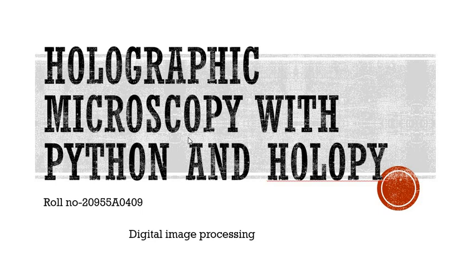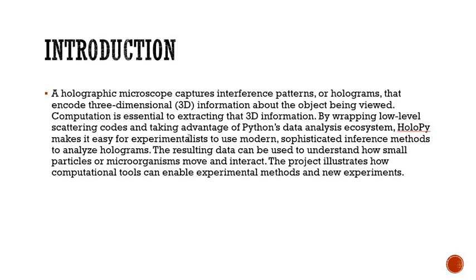The 3D forms are used in many applications. The holographic microscope produces images, and HoloPy is used to construct those images. Introduction. We have to encode the data in 3 dimensions.